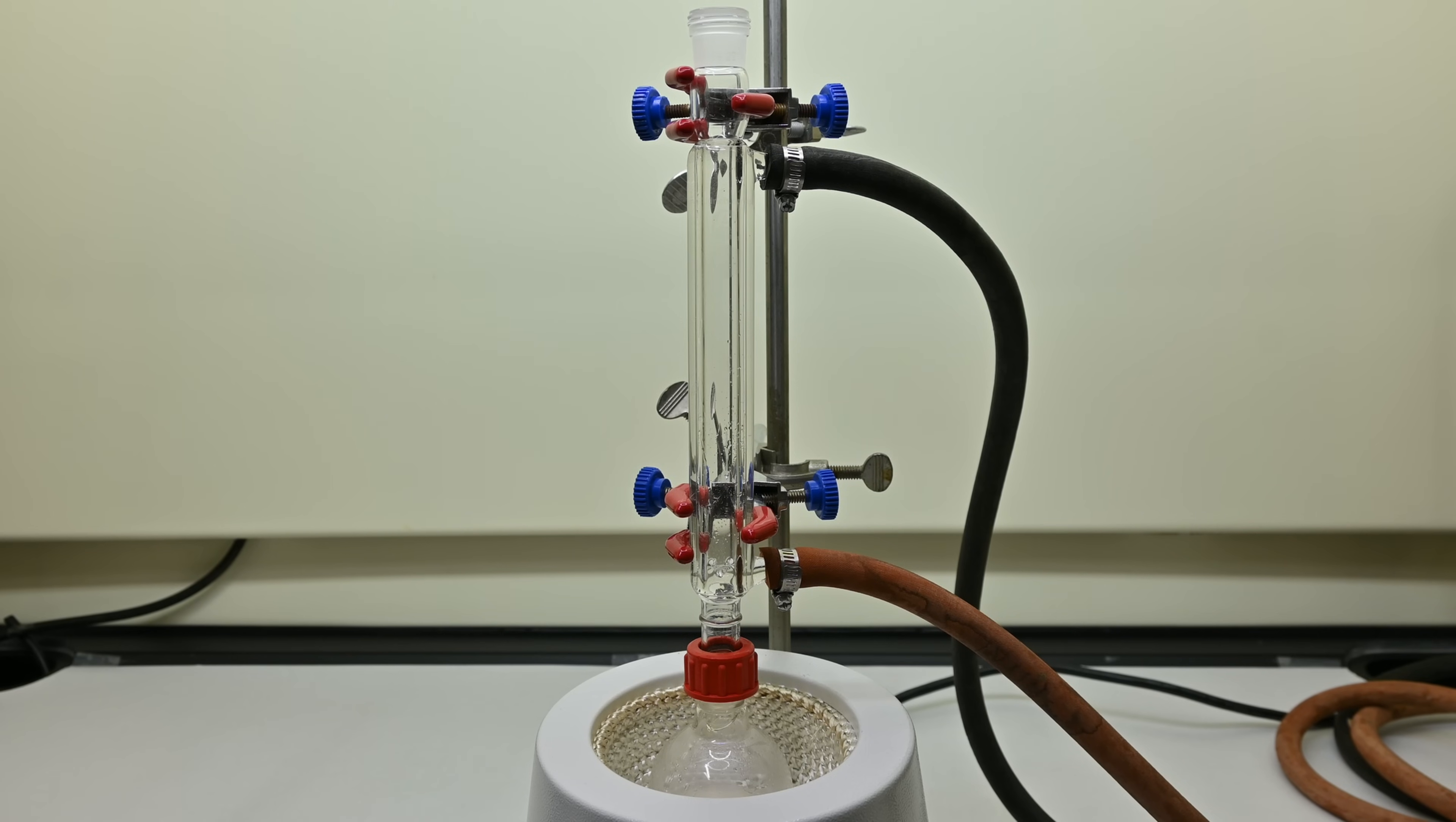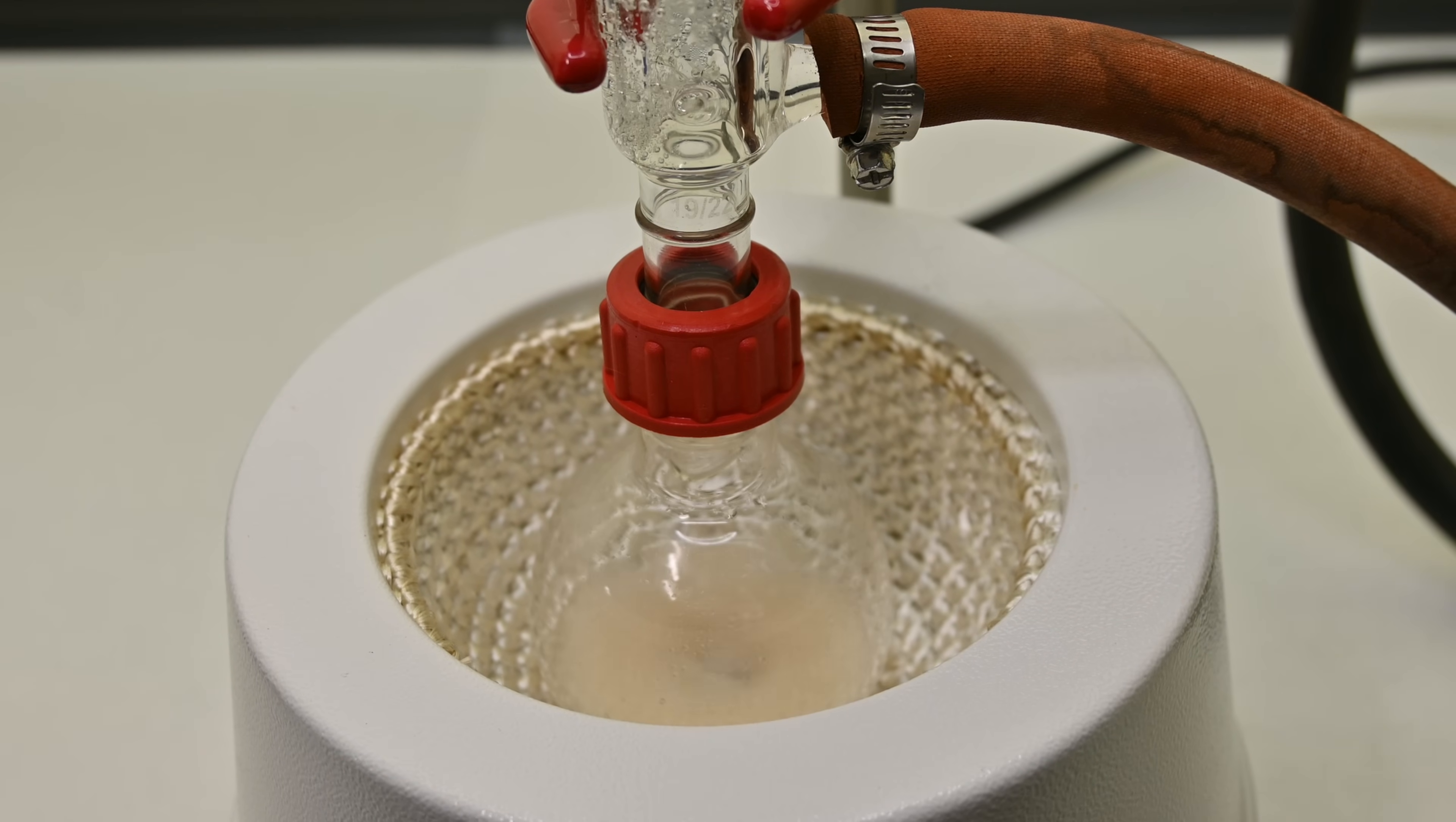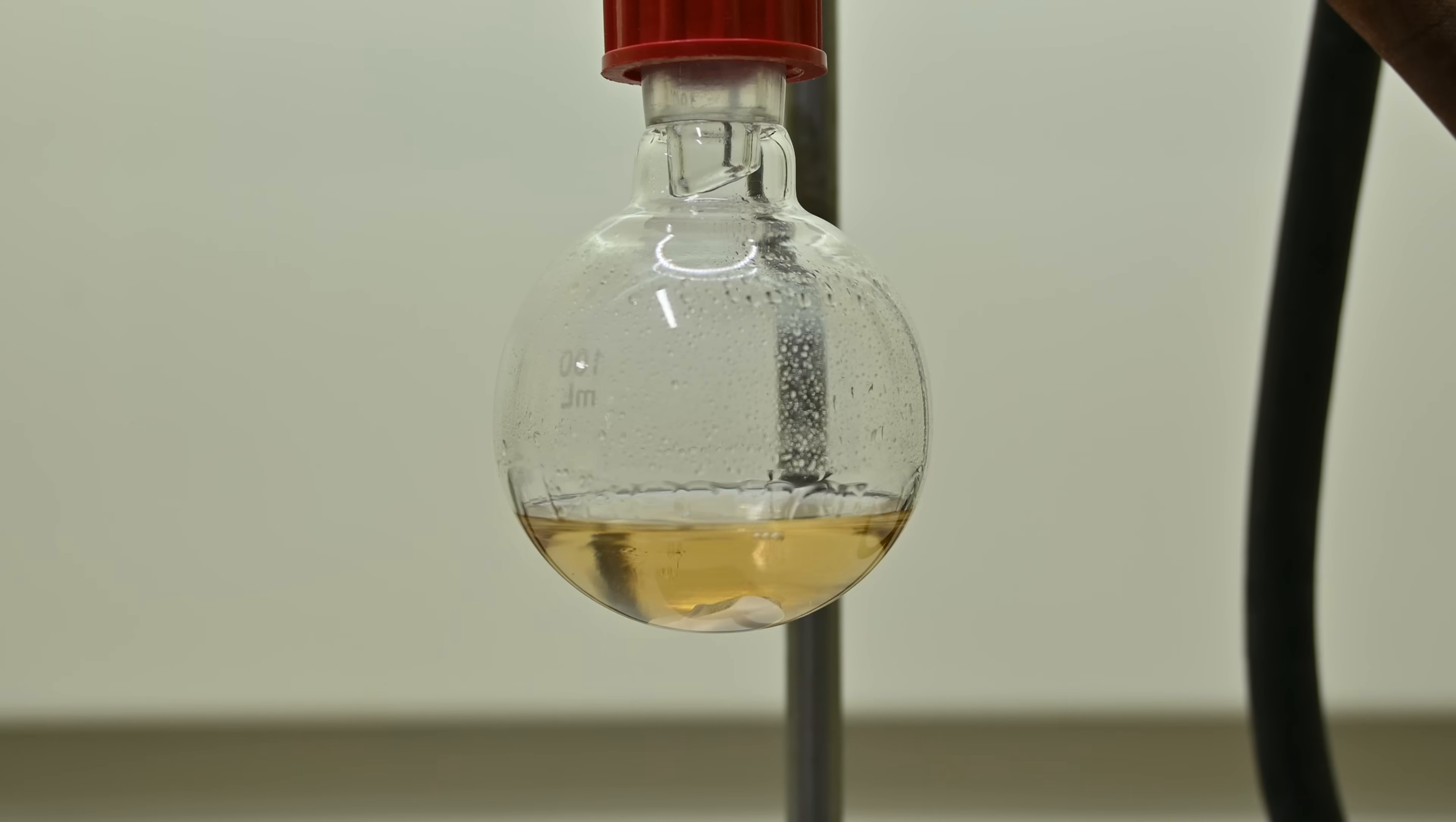Next I attach a reflux condenser to the flask and heat the mixture gently under reflux for about an hour. Refluxing allows the reaction to proceed at a high constant temperature without losing any solvent due to evaporation. The mixture continuously boils and condenses, cycling back into the flask. After about an hour I remove the heat and allow the solution to cool to room temperature.